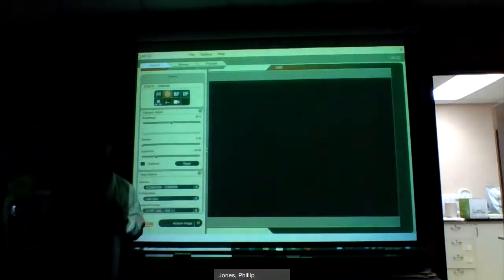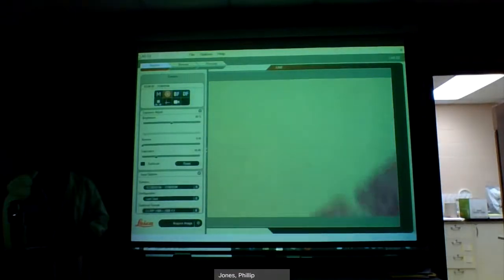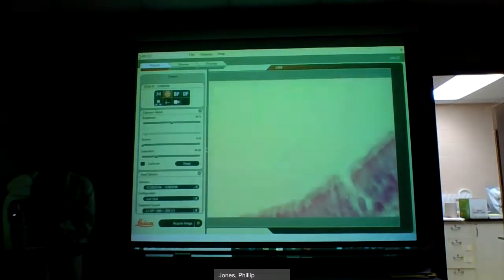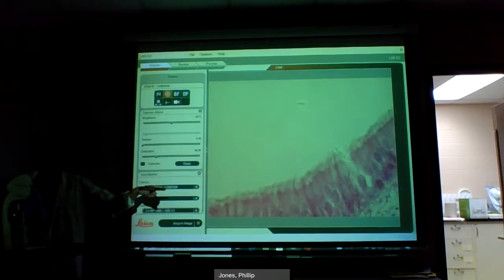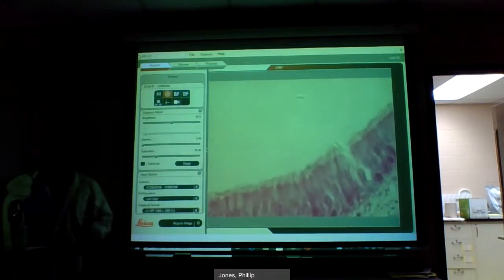I'm going to click the oil immersion lens in here and focus on it. We can all at least agree the object is bigger. I'm going to make it as clear as possible. There's the apical surface. Some of these are pseudostratified ciliated columnar — pseudostratified looks like it's layered, like it's stratified. But to tell the difference, each one of those cells goes from the apical surface to the base. They're not truly stratified; they just look like they are. Trace each cell down — at some point it will touch the basal surface.